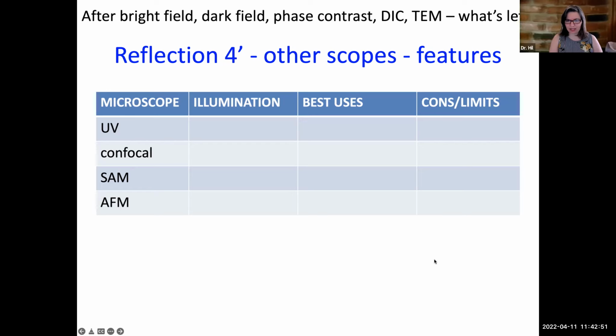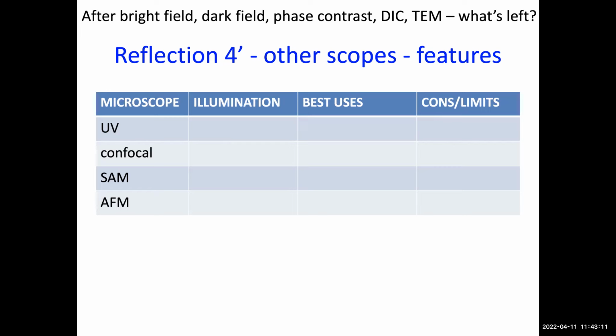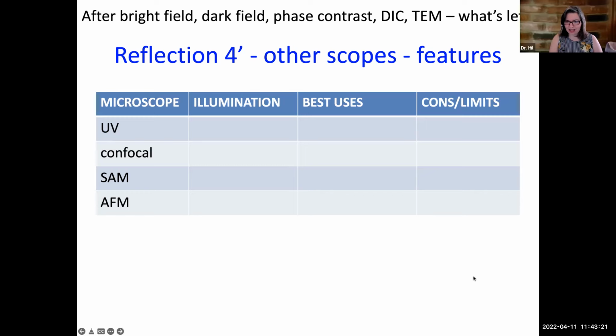For this one, I'm going to initially ask, let's see, Alina Park for the confocal. What do you know, if anything? If you have to pass, that's just fine. Can you hear me? I can hear you. Oh, okay. I don't really know, but I would say it has a high resolution. Yes, very high resolution for something that's not an electron microscope. High resolution, yes, excellent.